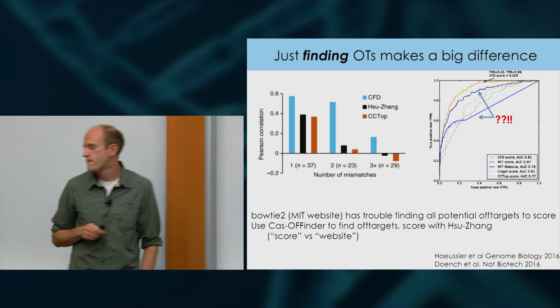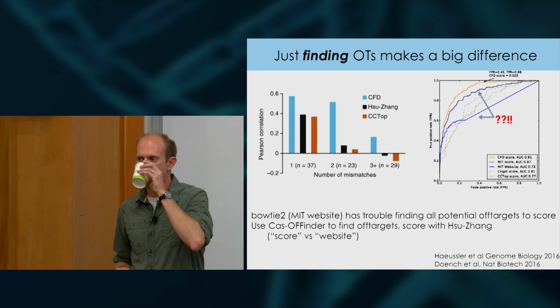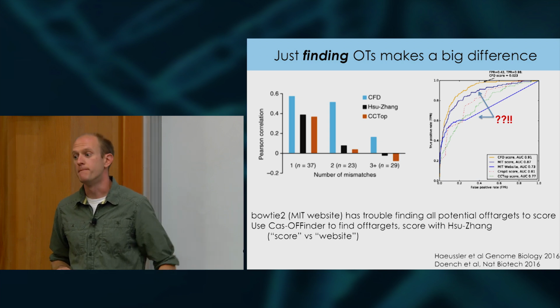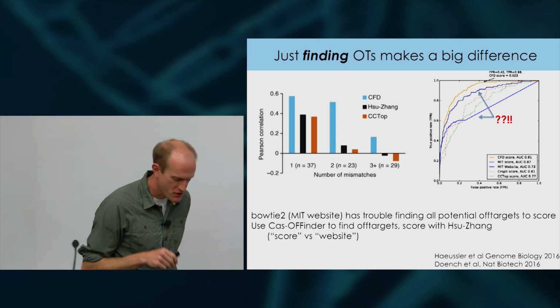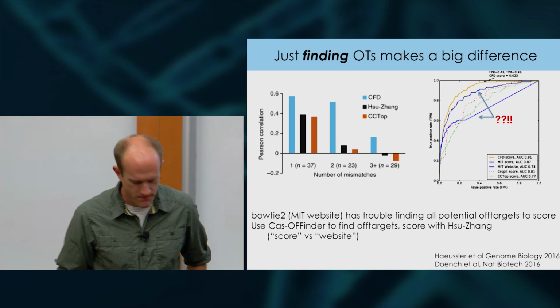And also just to add to that, for people who use BWA type algorithms or Bowtie themselves, there are parameters that will find everything, right? They just slow down those programs, but it's not an actual problem with the BWA algorithm. It's not that they can't find them. It's just which parameters you set for the search, right? So you can use those tools to find everything.